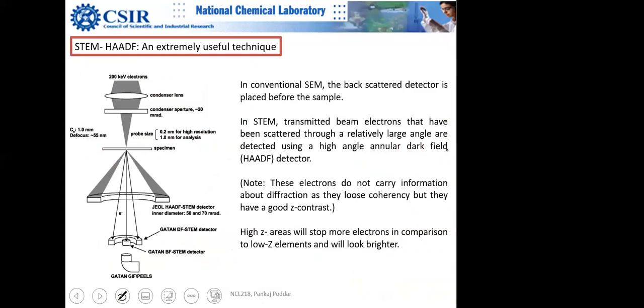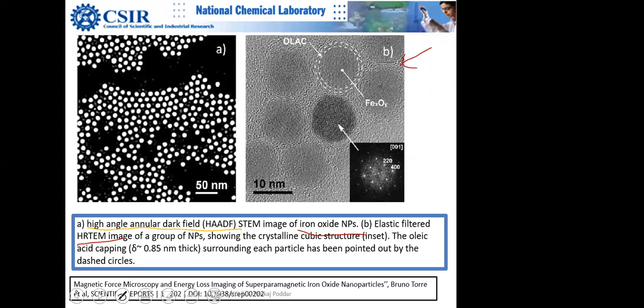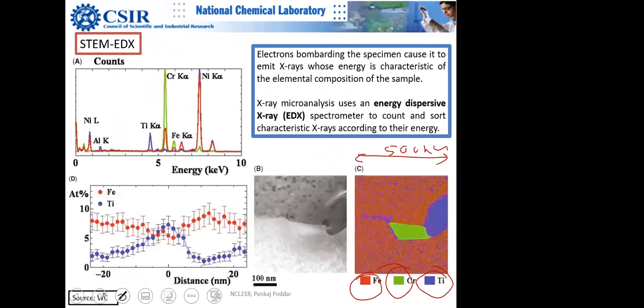So now you can ask the question, here they have shown oxygen, you know, here. See, this is basically a new generation of technique where resolution is much better, and the EDAX detector is much more advanced. So here they can afford to show you where oxygen is, but normally it should not be attempted because it's not a very good idea. So this is older generation data. In older generation you will not find oxygen, but in newer generation data you will find oxygen.